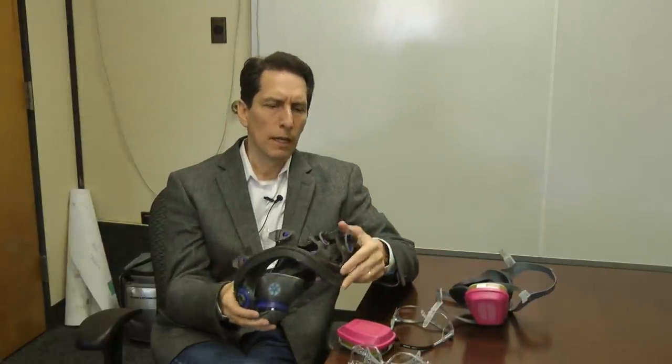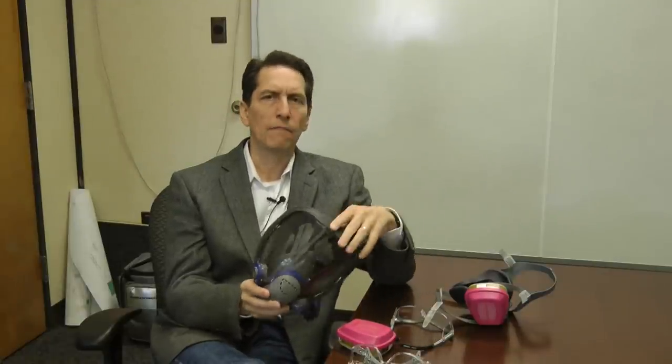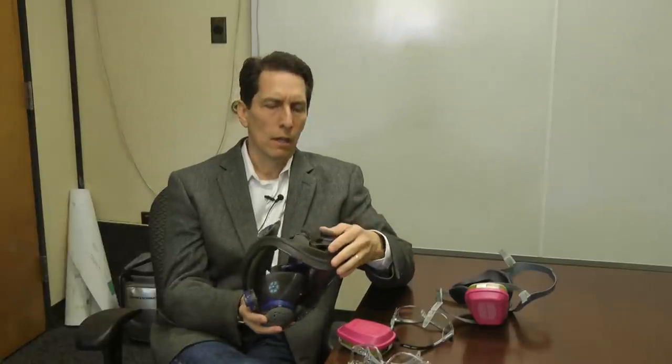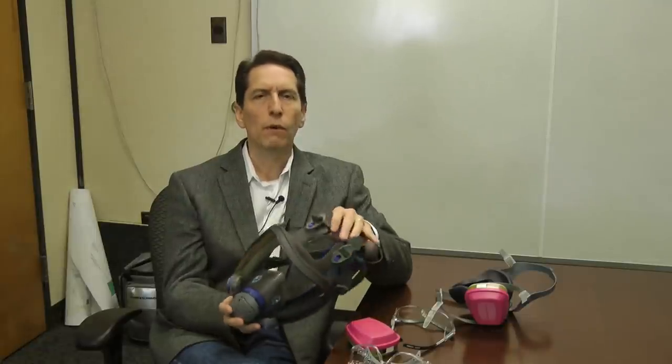The same applies to full face respirators — they're meant to go down in a bleach solution. I believe 3M's products, both half-face and full-face respirators, are rated safe up to 5,000 parts per million bleach, which is about five times the CDC-recommended level. I don't recommend going above one-third cup per gallon of standard 5–6% bleach, or a quarter cup for 8% bleach, as stronger solutions start degrading the materials.